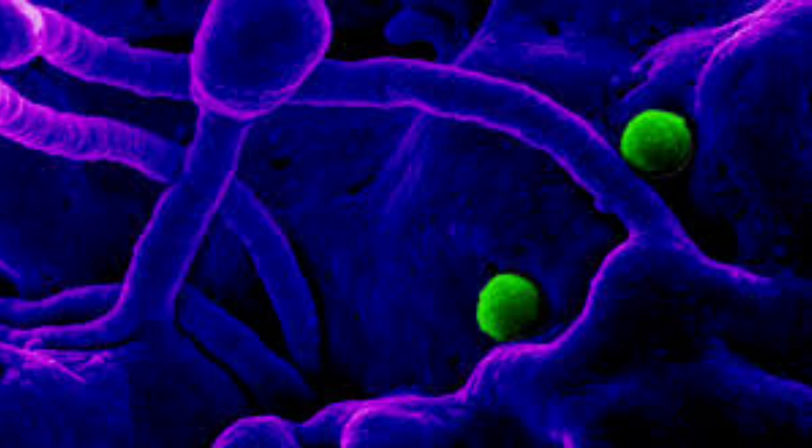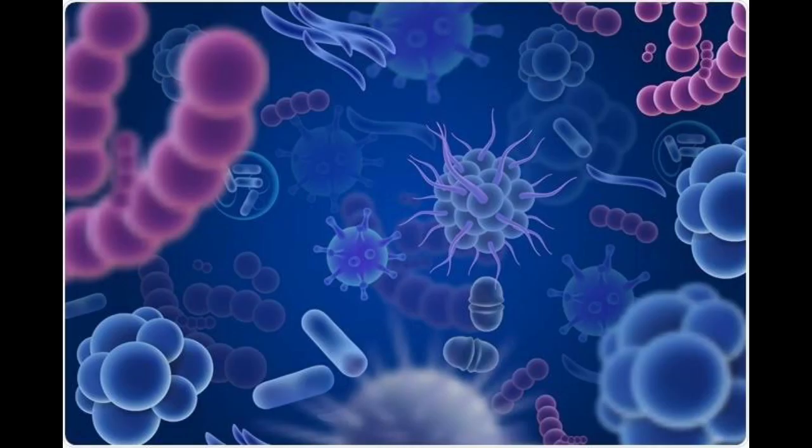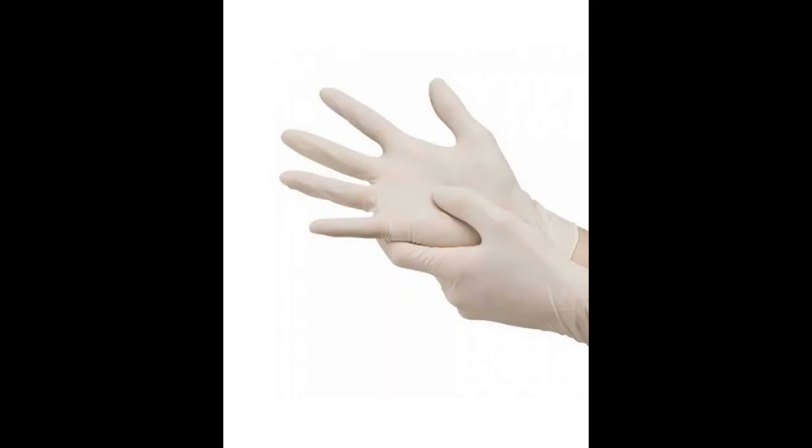They have multiple applications. Now let's come to the main point: how do we conduct research, or what are the basics of microbiology which we really need to know in order to study the subject of microbiology or applied microbiology? Basically, first of all, you need to understand the basic procedures we do in the laboratory. For that, you need to know that personal protection is the most important part. You really need to wear gloves. There are many types of gloves.